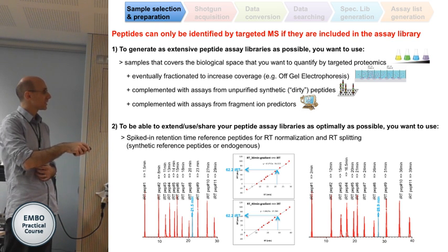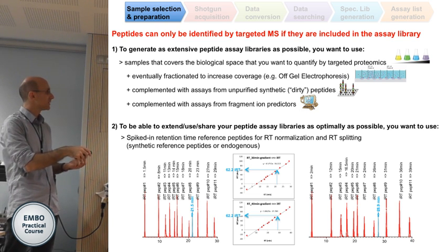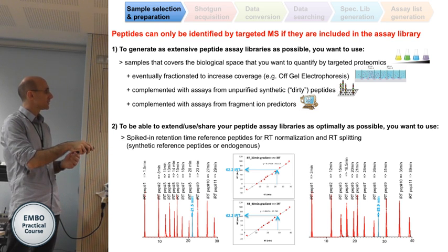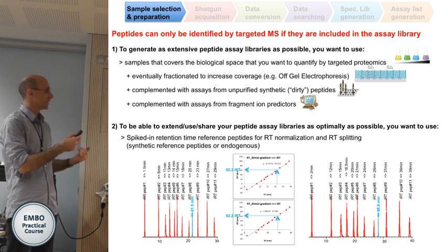So the peptide retention time is projected in this unitless space, which is this iRT space. So this 21 minutes is translated to 62 iRT values, and these 62 iRT values then translate to another retention time of 29 minutes in the other conditions.